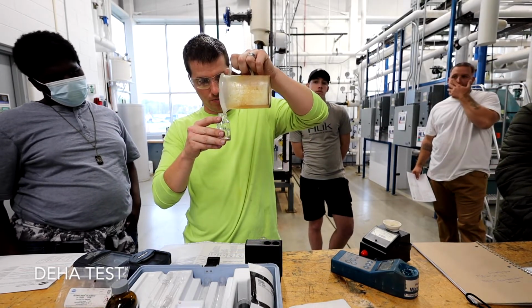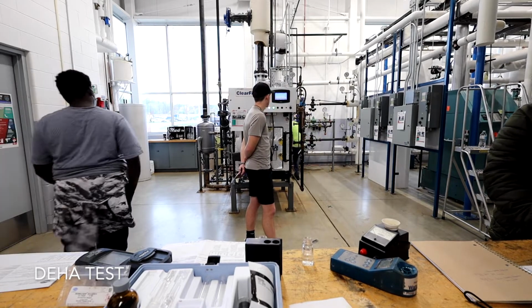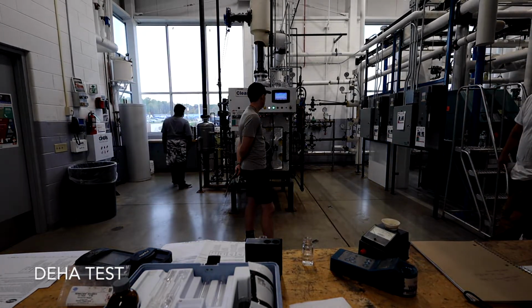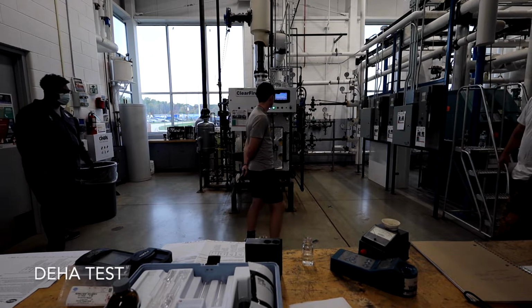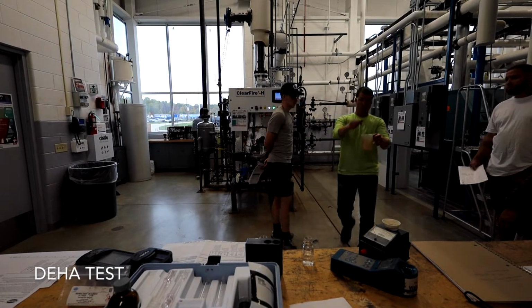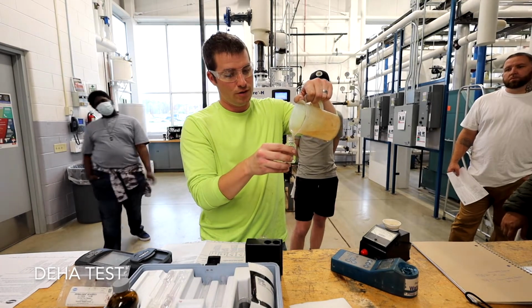All right, so we'll fill this one up. I rinsed it twice thoroughly. I've got to get more water, one second, everyone. The only problem with where I'm grabbing the sample is you can't really get your cup in there very well because it's so close to the ground. So long term, we would get a sample pouring out the bottom of that feed water tank so I could actually fill my cup and wouldn't be grabbing sample after sample. That's one way we can improve operations here.